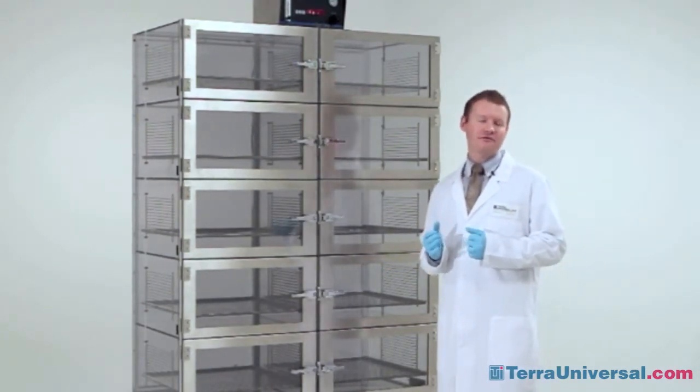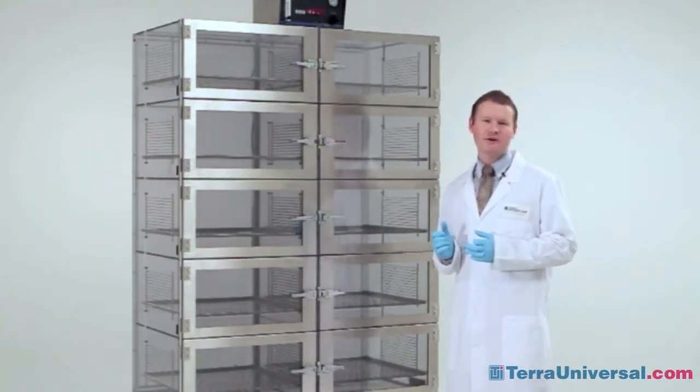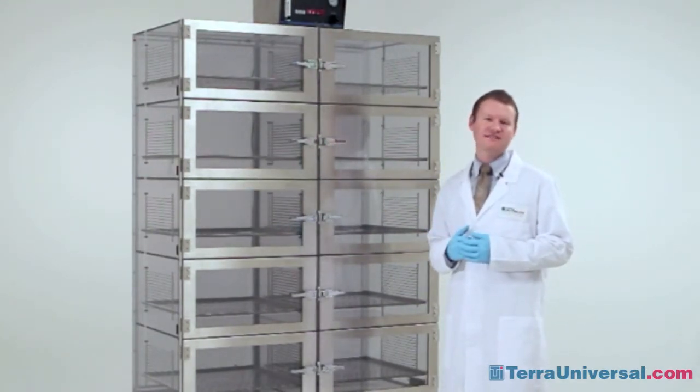Terra's parts are all fully standardized and easily lot traceable, so if any of your components break down, they can be replaced in a jiffy.